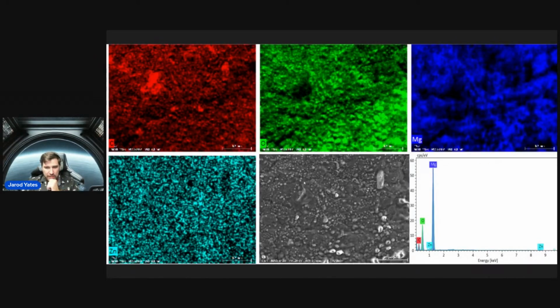All right, so this same image that we were just looking at, I've split it into the colors here so you can see what's going on. Yeah, we've got carbonization everywhere. We've got oxidation. There is a serious shadow or lack of oxidation in these two carbonized areas, right? The long guy and the potential skin cell or something. There's also a lack of magnesium in that area, which is weird because we have somewhat of a lack of zinc, but not nearly as much as the lack of oxygen and magnesium in these two areas.